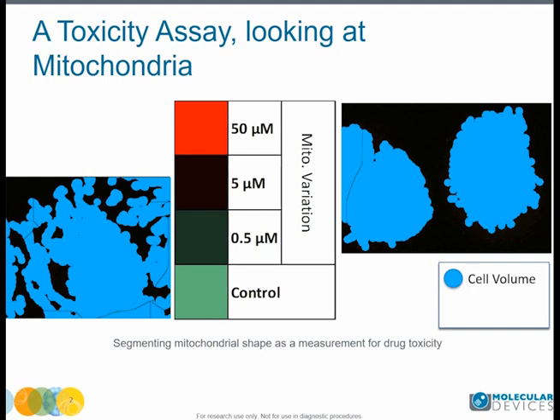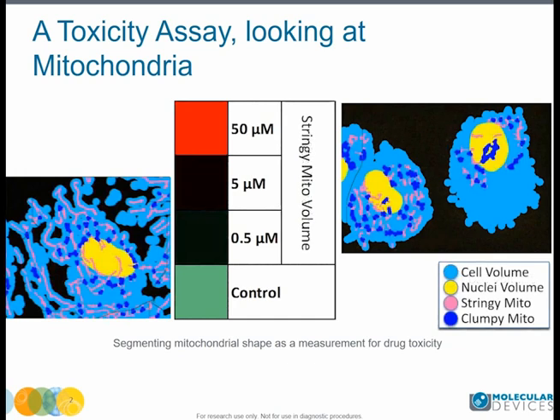For this presentation, and in the spirit of high content, we will use a more in-depth module that can give us more values, like volume of mitochondria or the ratio of stringy to clumpy mitochondria.